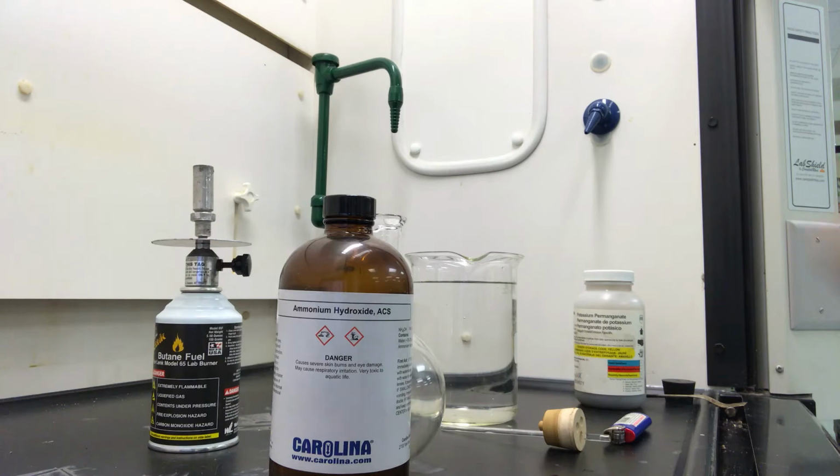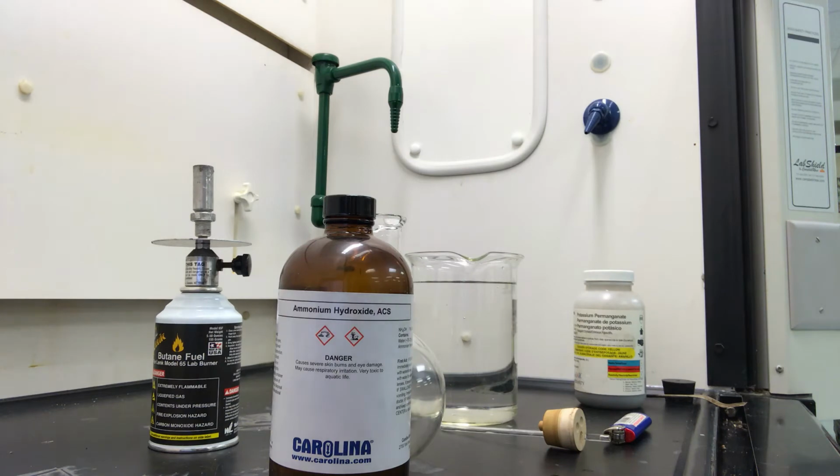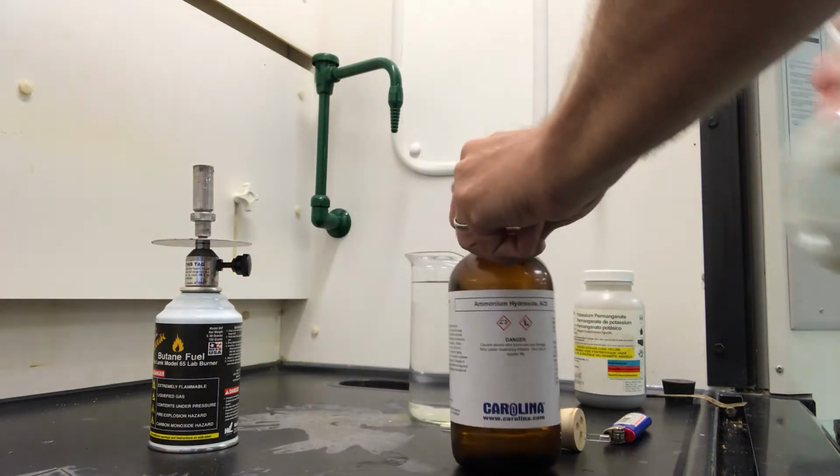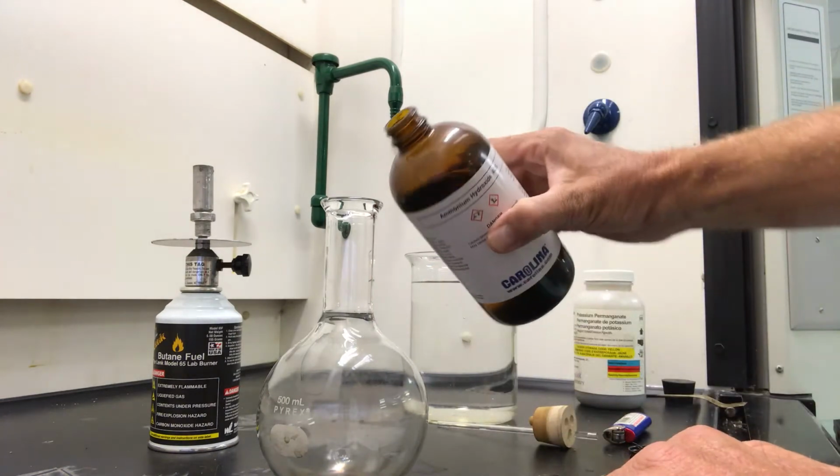That's ammonia solution. It's basically what you're going to use in Windex or any sort of cleaning agent. But this is more concentrated than you could buy from Food Line. Ammonia solution releases ammonia gas, which is what I want in this experiment. And I'm going to put it in this round bottomed flask.